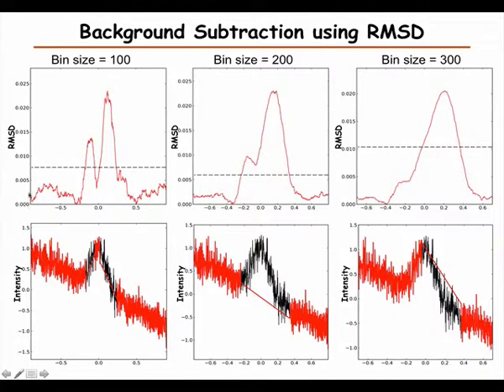And what happens is that over the background, even though it's on a slope, it will be pretty constant. There's some variation, but it's mainly due to the noise. And then when we have the peak, we get much larger values.